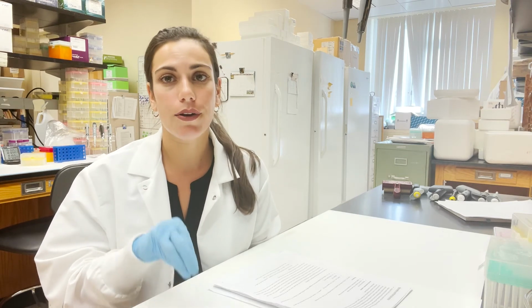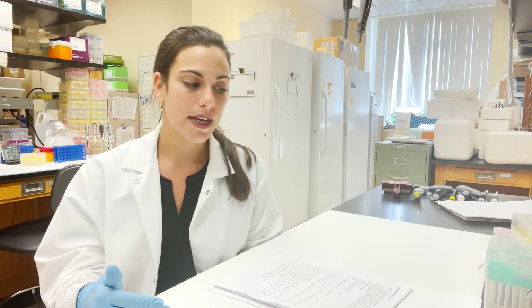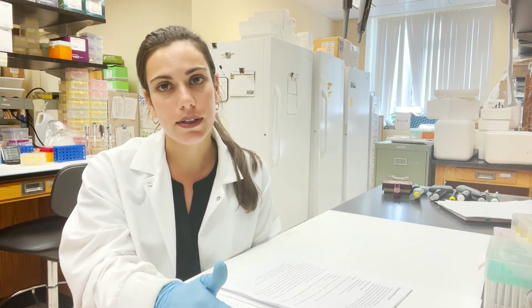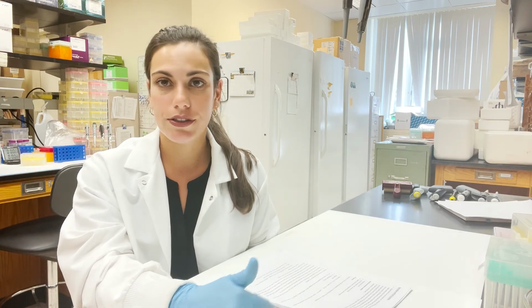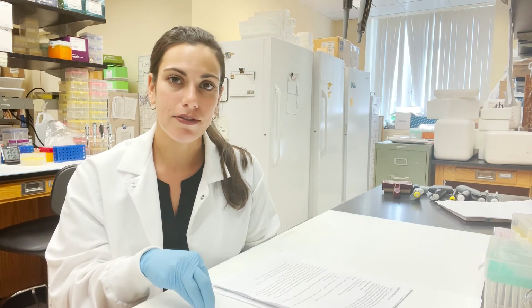The final stage, which I will not be showing you, is when we normalize and pool our libraries. And what this means is that we have 48 samples on a plate that each have a unique barcode, and all of those samples are going to go into one tube at the end, which will then be run together on one lane on an Illumina sequencing platform. So the way that we'll normalize and pool is I would take all of the concentrations that I got from the Qubit, use my C1V1 equals C2V2 formula to get one uniform concentration, pipette all that into a new 96 well plate, and then take a set amount from each of those plates and put it into one final Eppendorf tube for each of my plates.